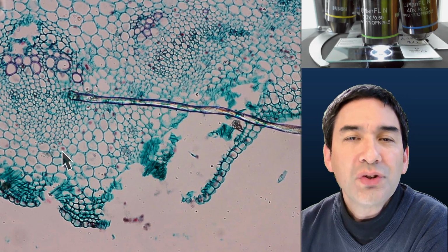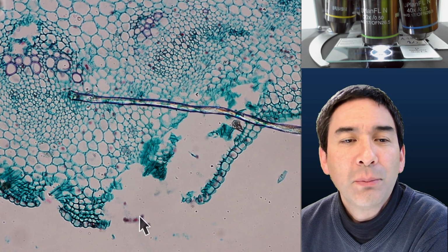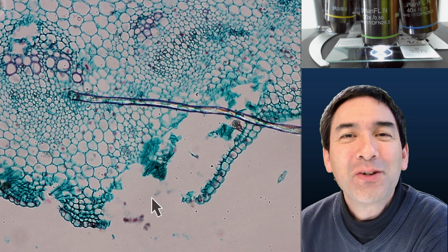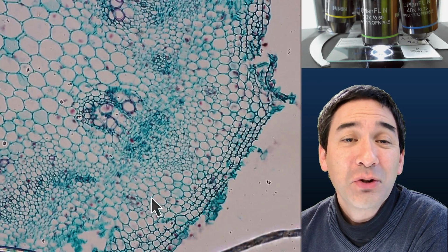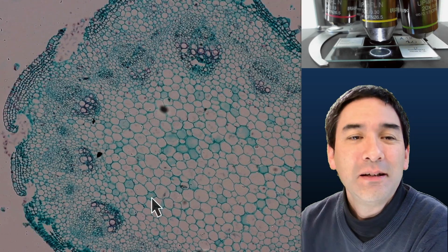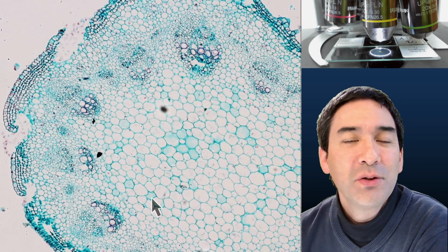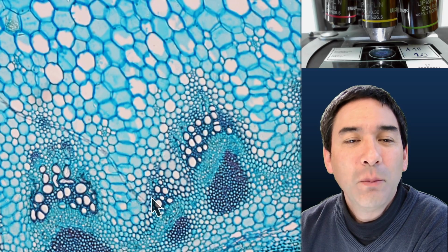Also, when you make the cross section very thin, like you have over here, then you're able to see that sometimes the specimen is ripped apart and torn apart. My recommendation to microscope slide manufacturers: do not cut your sections too thin either. I think concerning manufacturing costs, there should not be really a difference on whether you make the sections thicker or thinner. But let's go out a little bit again here. And you can see now that the cross section here is not quite as heavily stained as the other one over here. Right. Yeah. So that is a short comparison.